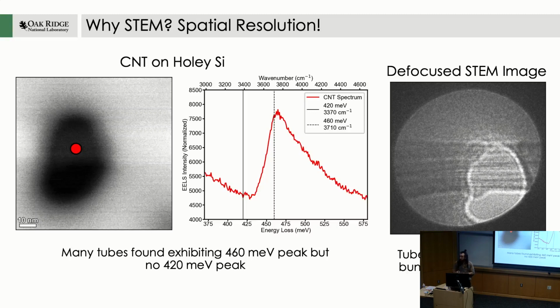What's the radius of these nanotubes? The radius of the nanotubes can be anywhere from 1 to 5 nanometers, and we can have varying numbers of walls as well. This is one of the reasons we also don't like studying it like this, because when you have this bundle, you can't measure the inner diameters, the outer diameters, or the number of walls, because there are too many things overlapped on top of each other, so you can't actually see what's happening in this sample.